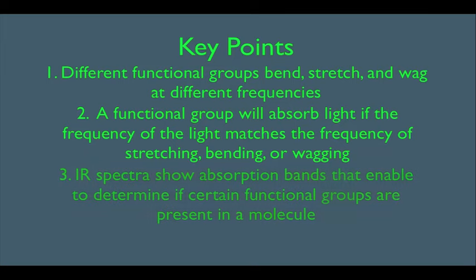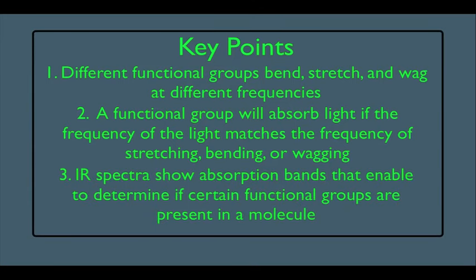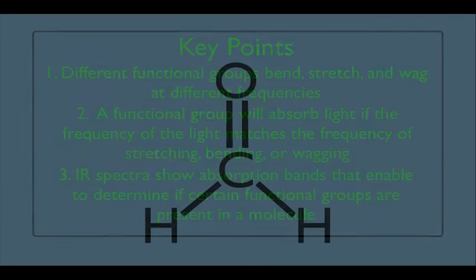And lastly, what we're going to see here is that, three, IR spectra show absorption bands that enable us to determine if a certain functional group or groups are present in a molecule. So let's see how this works.